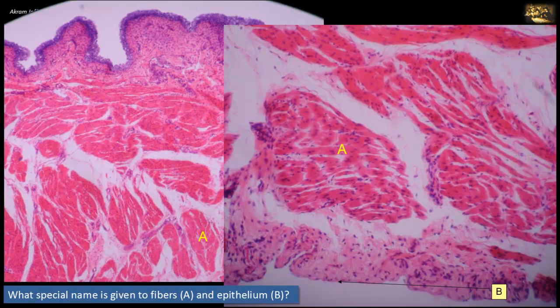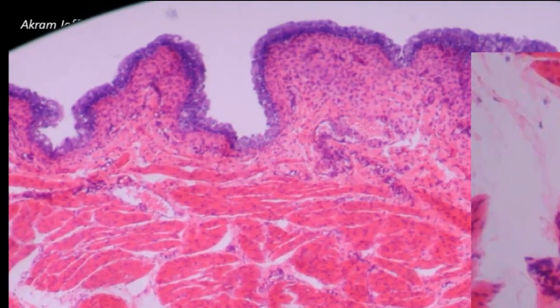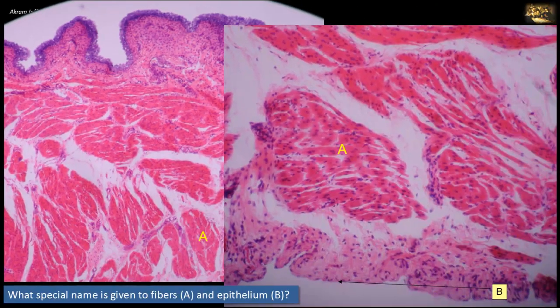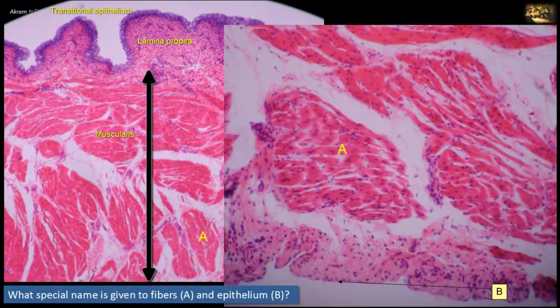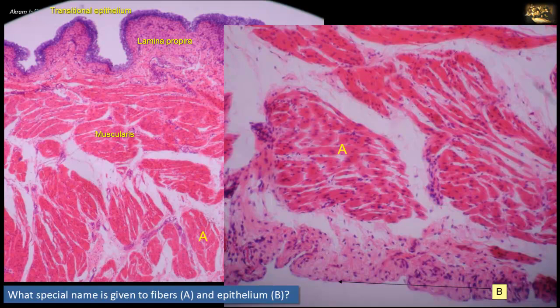What special name is given to fibers A and epithelium B? Both photomicrographs show an abundance of muscle fibers in the wall of this structure. In the photomicrograph on the left, there is a transitional epithelium in the mucosal layer — this is the wall of the urinary bladder. The mucosa is thrown into folds in the relaxed state and has a layer of lamina propria. Deeper to that is an extensive muscular layer, the muscularis, formed of smooth muscles irregularly arranged into layers. This irregular arrangement allows mass contraction resulting in emptying but not peristalsis. These muscle fibers in the muscularis of the urinary bladder are called the detrusor muscle.